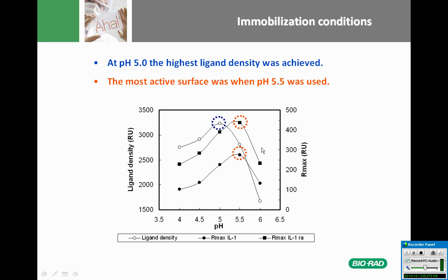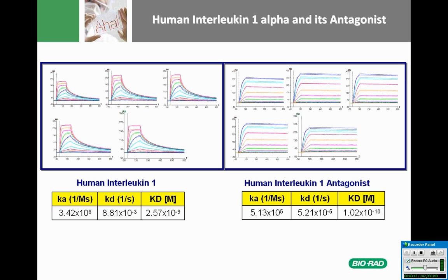And this is a nice way to use the 6 channels to characterize in one time. You have a new pair of proteins. You want to determine their kinetic binding constants, and you have no clue, just the first time, of what would be the best condition. So you can test 6 different conditions at one time on a single chip in just a few injections, and you can get the answer of what the best conditions are, and of course, together with that, to have the results.